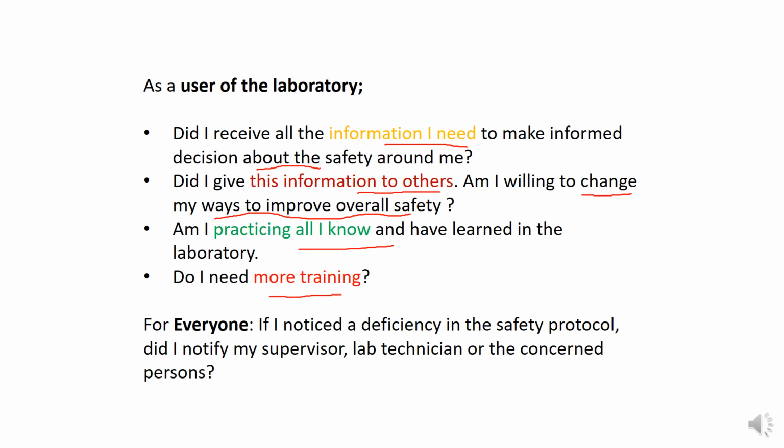So for everyone, if you notice a deficiency in the lab safety protocols, of course, do you notify your supervisor, lab technician, or the concerned person? This is actually a duty. For example, if I'm working and you are working, and we observe that one is not doing a good job in the lab, then it is your duty, you can train them. Otherwise you can tell the doctor or the technician, so that they can train them, right? Ultimately the idea is not to injure himself, but also other people. So this is all about the safety of other people.